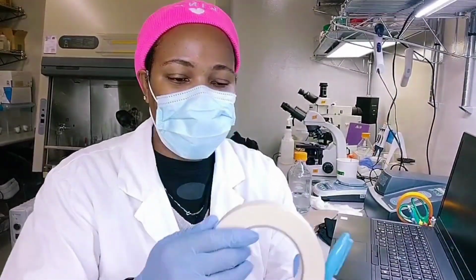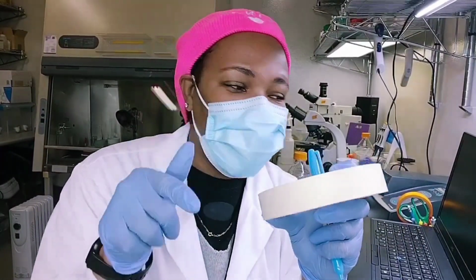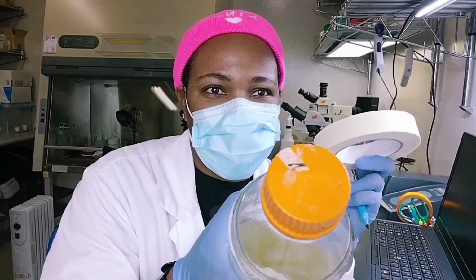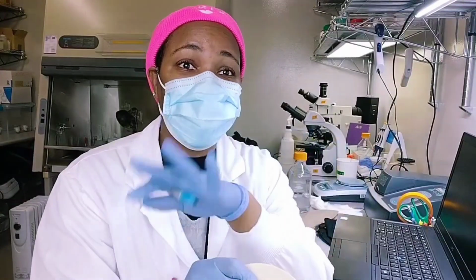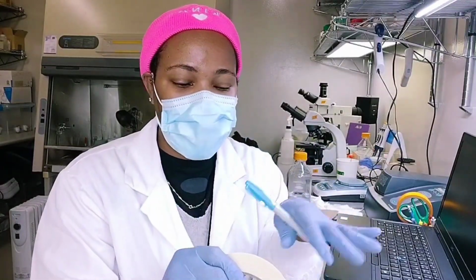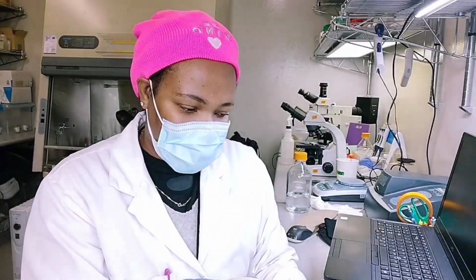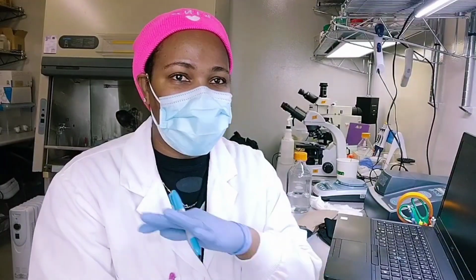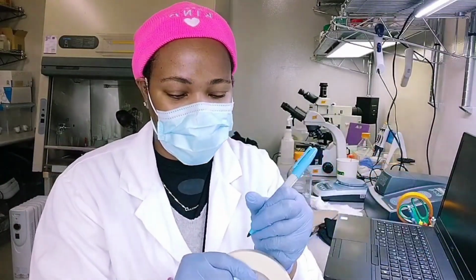Standard practice. Again, the lines, you can't see them, but once you're done, they change to black. And again, that's an indicator. If you've tested your autoclave and you know it's working well, then this is an indicator that the run you sterilized your things on went well, so you can have confidence that your product has been sterilized and bacteria, fungus, etc. have been killed, and then you can go and do sterile work if you require sterile things.